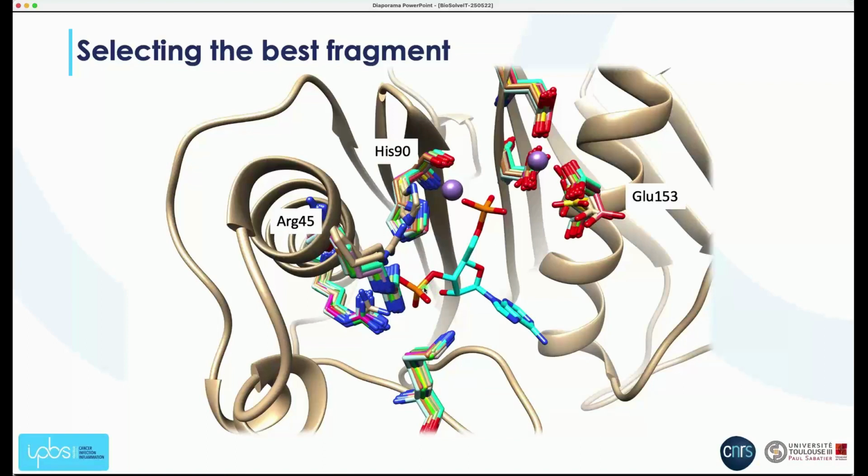coenzyme anymore. So it comes to the point that in some cases, the fragments will decrease the interaction of the protein with its cofactor. And it's to the point that in some structures, it seems that the electron density suggests that the cofactor is actually not present in the structure, as if the fragment binding would expel the cofactor out of its binding site. And this, of course, is quite interesting.